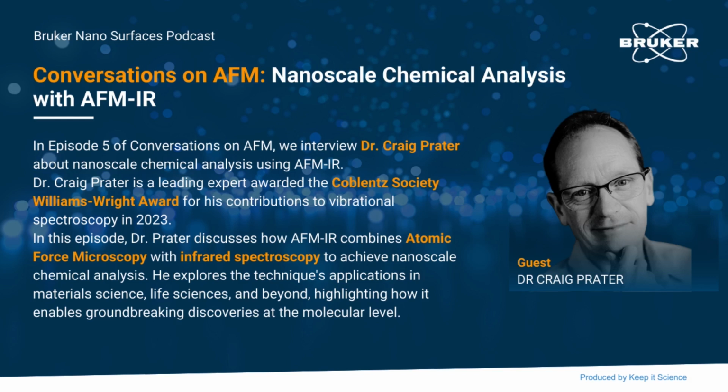And specifically how it works is there is typically a tunable infrared laser that is aimed at the region of the sample where the AFM tip is touching the sample. And if the tunable infrared laser is tuned to a frequency or a wavelength that corresponds to an infrared absorption band in the sample, then part of that laser light is absorbed as heat. And specifically what's going on is that if the vibration frequency of the light matches the vibration frequency of molecules in the sample, then part of that light goes into exciting the molecules, causes them to heat up.